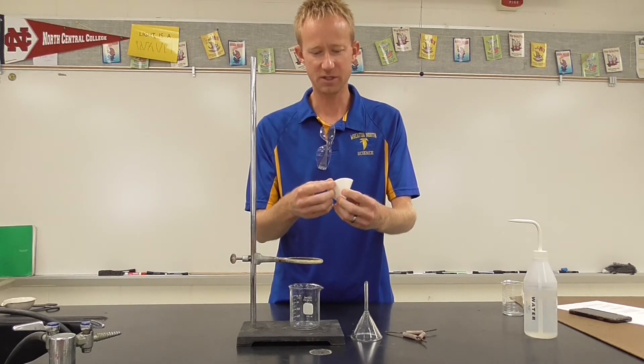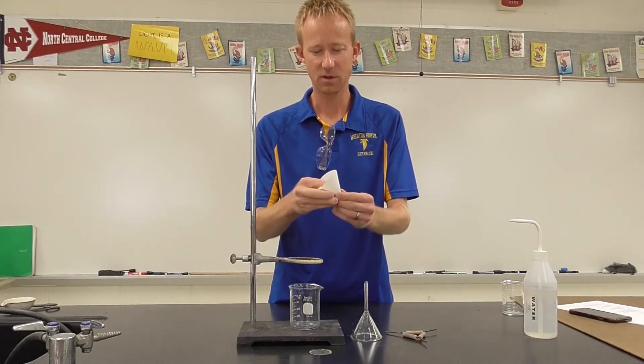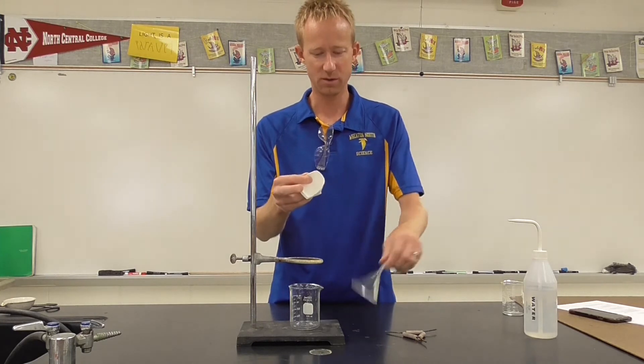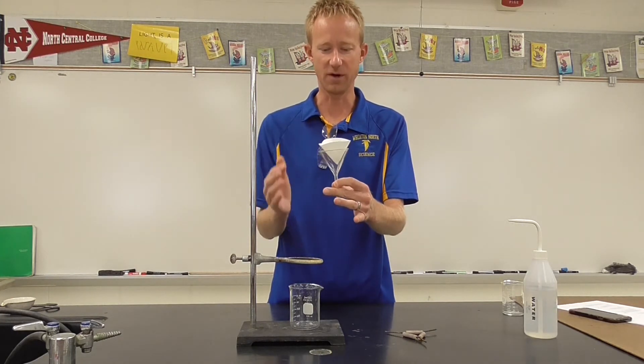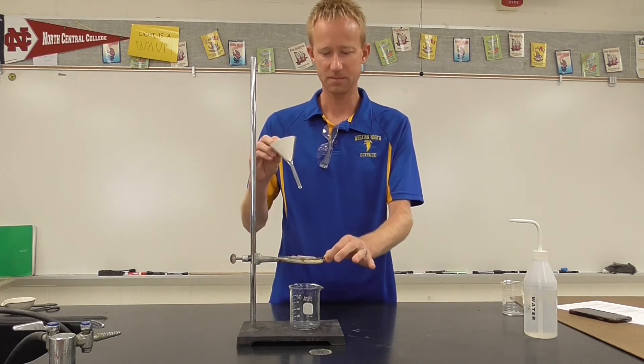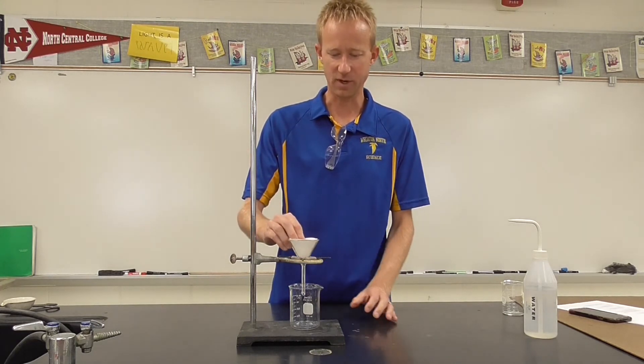What you'll notice is you're able to open up one of the flaps on the filter paper and produce a cone. This cone will sit inside of the funnel. You can place your clay triangle on top of the ring and your funnel on top of the clay triangle.